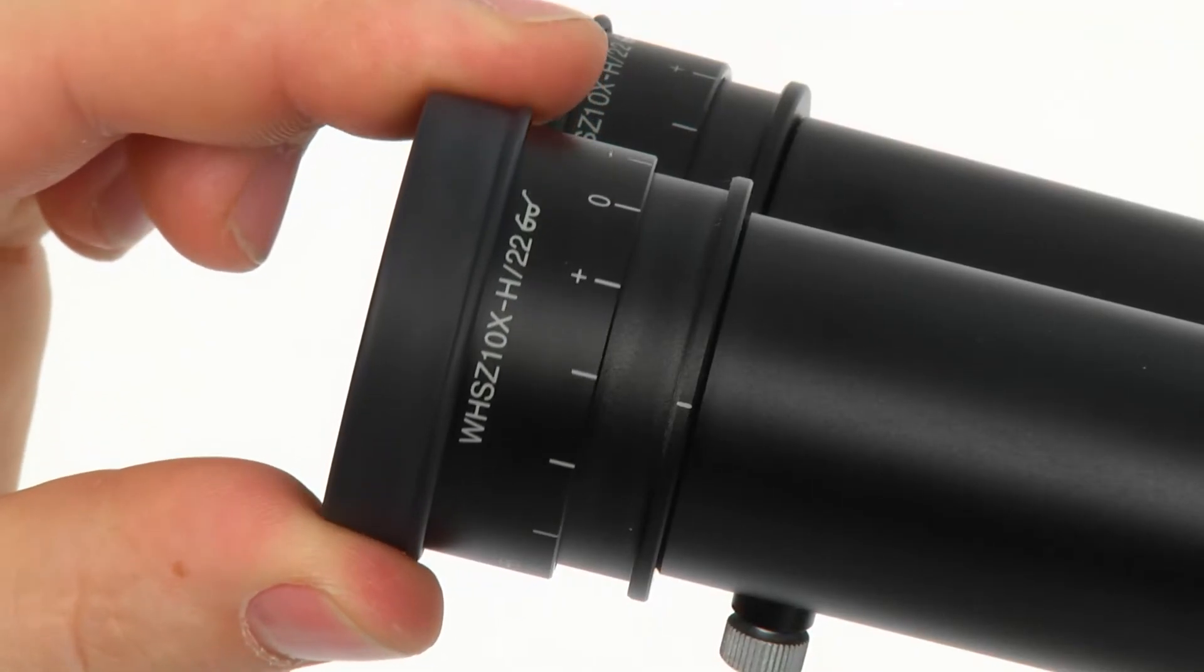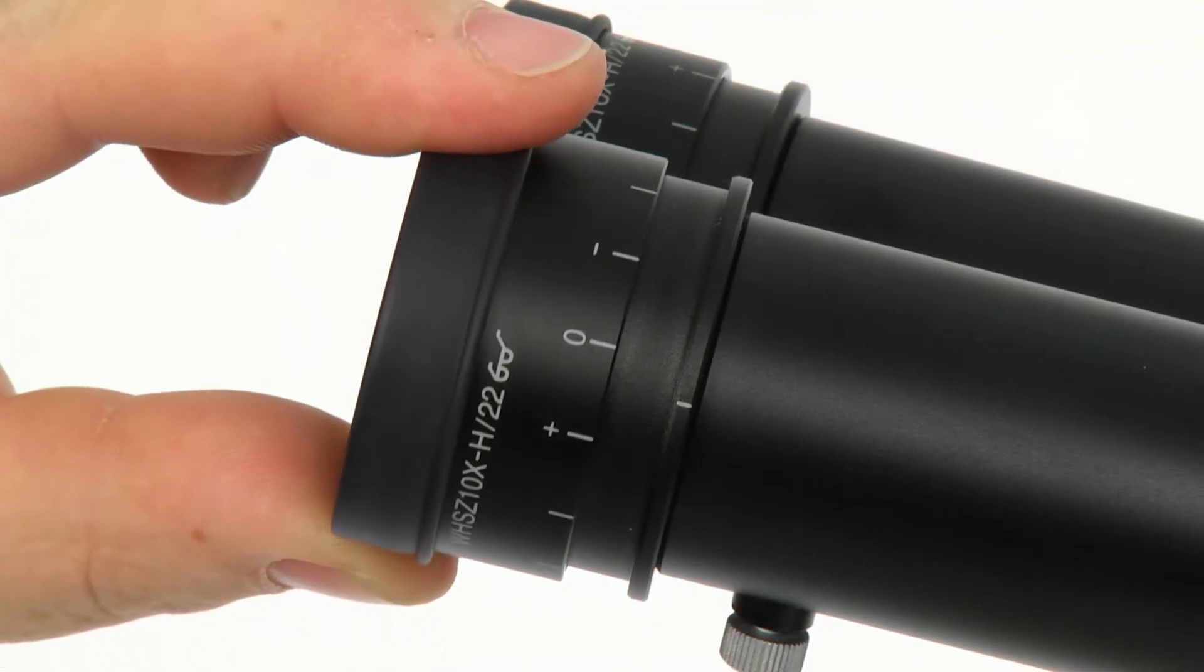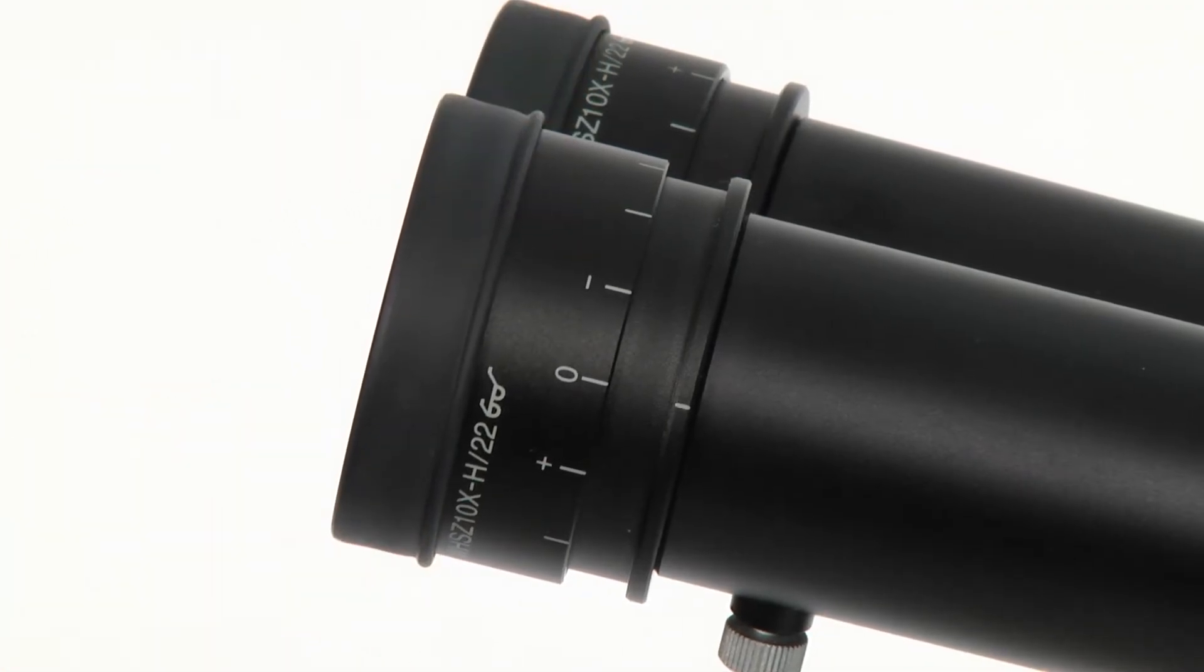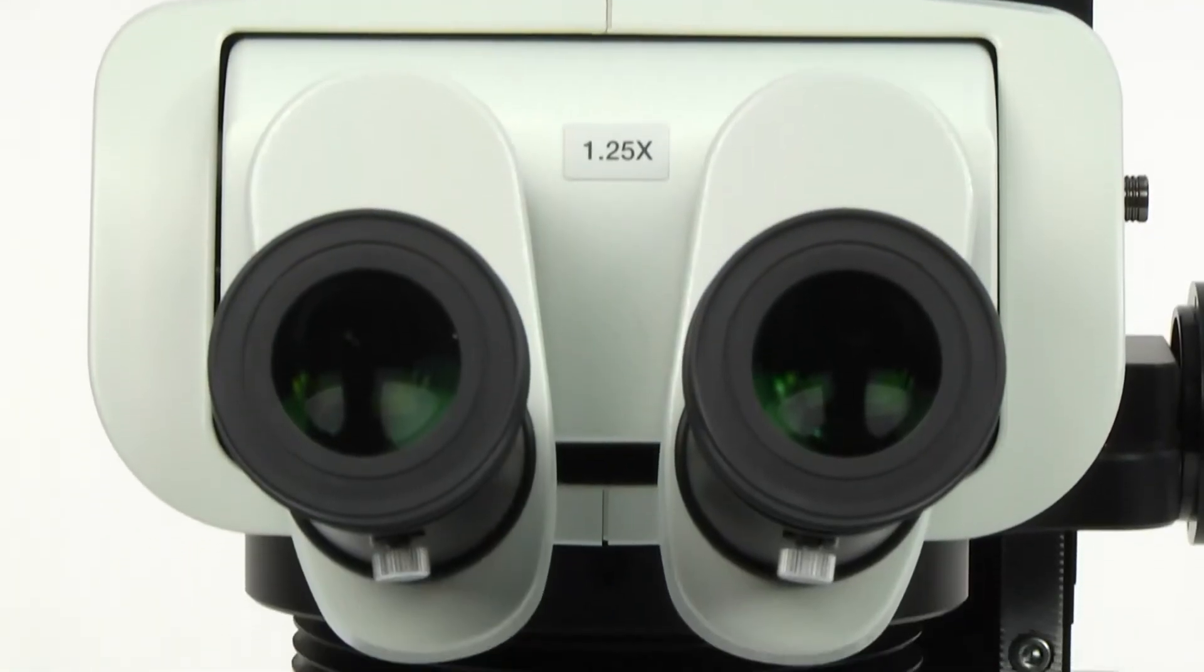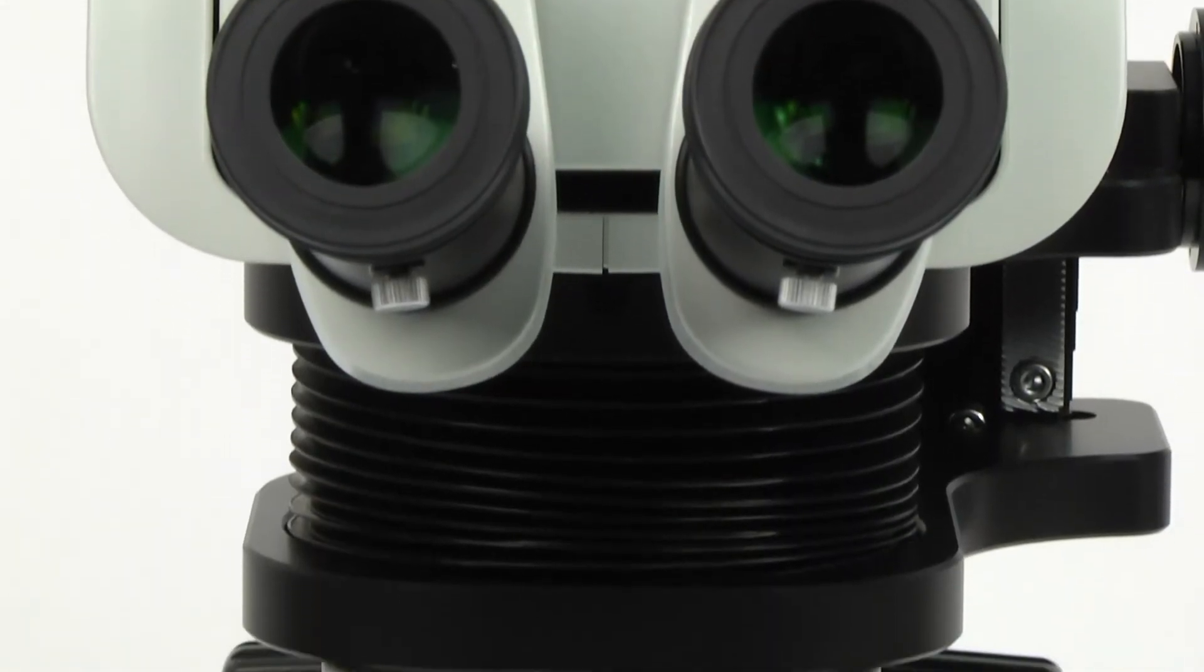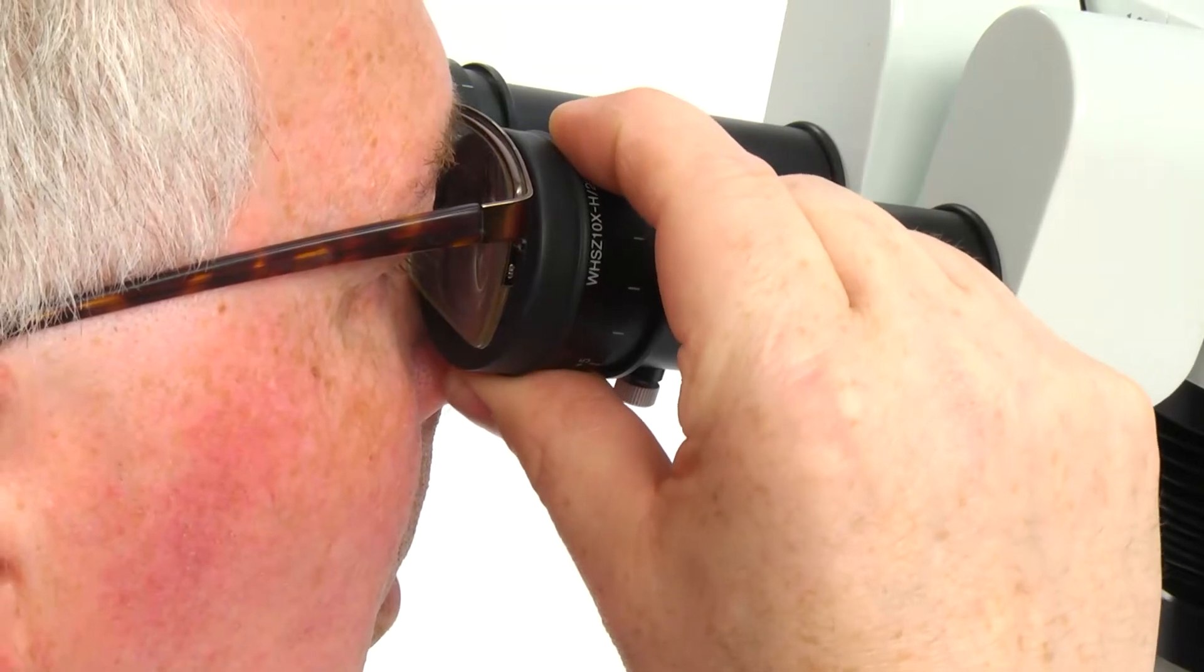To make the adjustment, turn the diopter rings of the left and right eyepieces to position zero. For operators with perfect 20-20 vision, this is the correct setting. All others require the following adjustments.